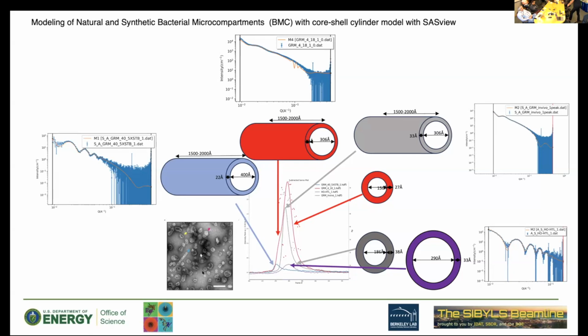Scott: This field flow fractionation device that you're purchasing, what ranges of sizes of particles is it best for? Can you use it for really small 20 kilodalton proteins, or is it just for big things or everything? For big and small too, but we don't want to use it for small ones, because SEC will probably give you better signal, with less dilution. There will be a little bit more dilution for FFF.